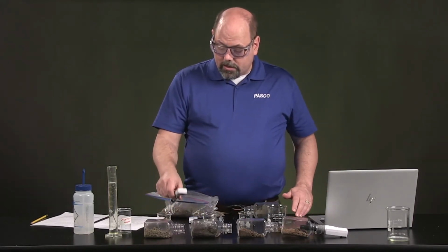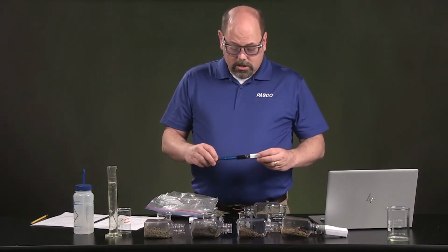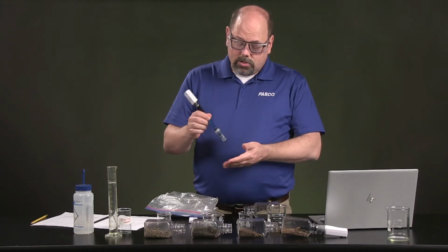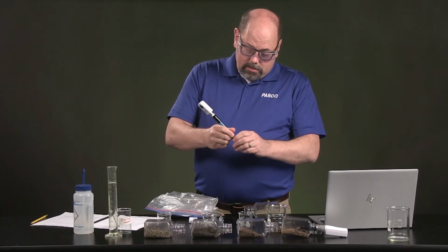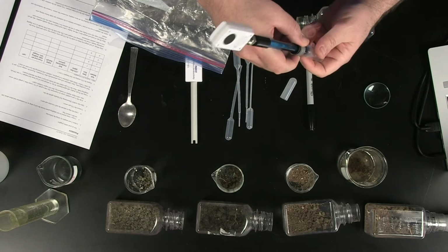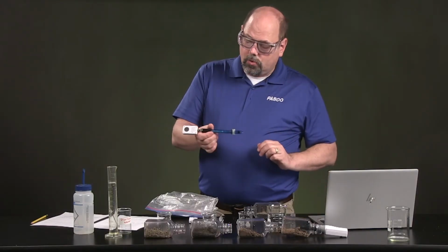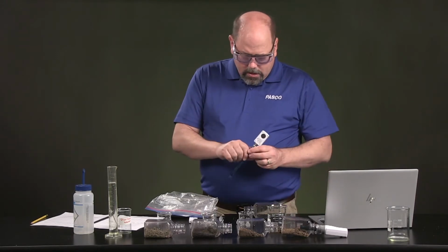Then the next ones that are going to come up, once you've measured the conductivity of each of these, you're going to use the pH sensor as this settles, and you're going to try not to touch the soils with the bottom. You're going to take the cap off. Usually I take this cap. And if I'm out in the field, I don't like to take this off. I usually push it up just to hold onto it here. But we're inside the lab, so I'll go ahead and remove that.